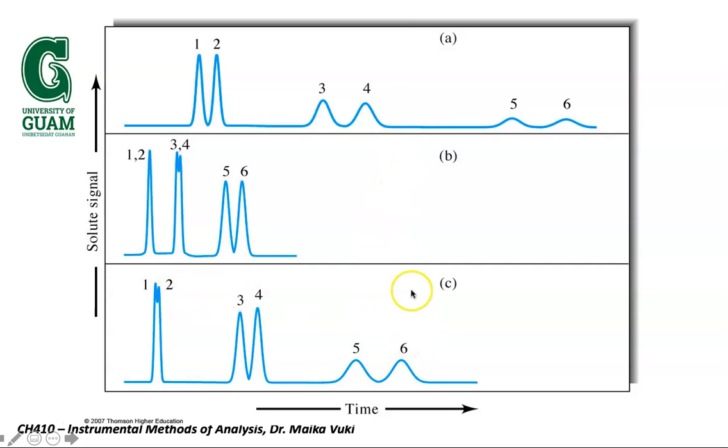So in other words, looking at this, you might have to have a compromise between a very, very lengthy chromatography analysis, or one that you can work with, like here in the third chromatograph.